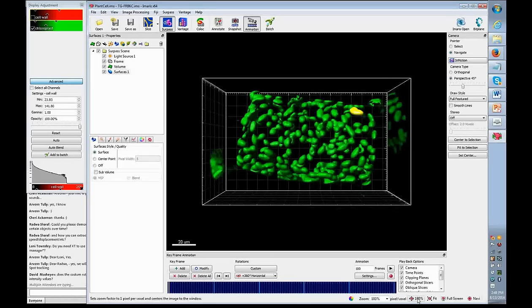Here again we have a gap of 1, 2, and then it's actually gone, so we don't need to worry about closing it. Now if you don't check this box, it won't run that spots detection on the gaps. It will just leave them as gaps and try to make a connection between, for instance, time point 10 and time point 13. In between, at 11 and 12, there will be no measurement data.